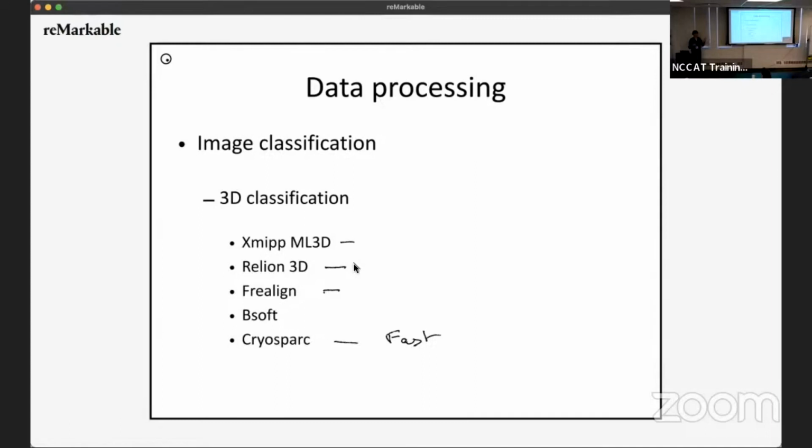So if you take references of the same thing at different resolutions, filtered at different resolutions, or different things, everything collapses to one reference, and the other 4 or 5 that you have will be black, like no particle will go to it. The reason for that is totally obscure to me. It just happens to be like that. And I try to play with it a lot, never managed to find a fix. So there's some statistics that don't get properly initialized, basically, and as a result, it goes to hell.